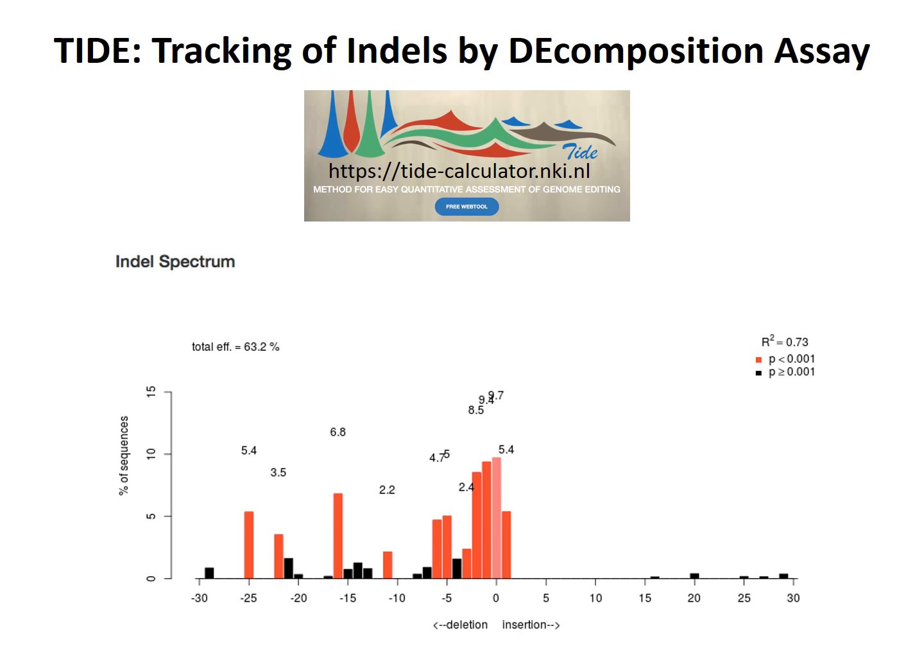So can we transfect the guide RNA as an oligo directly without... Yeah. Basically, the way that we described using the CRISPR-Cas9 system here is on the cheap. This is using all plasmid-based systems that are very affordable, like we showed. You can make a guide RNA for $20. But in fact, you can now order RNA oligos of 100 bases that encode the entire guide RNA, and you can deliver that to a cell as a guide RNA for gene editing.